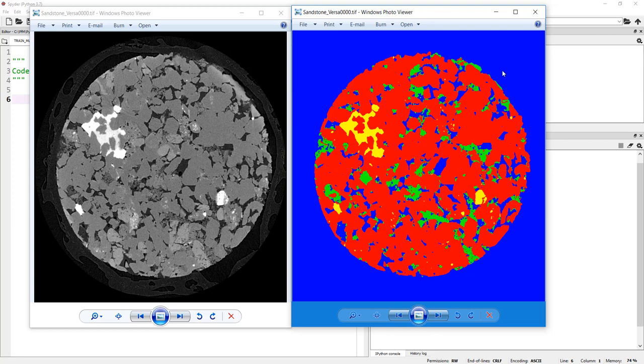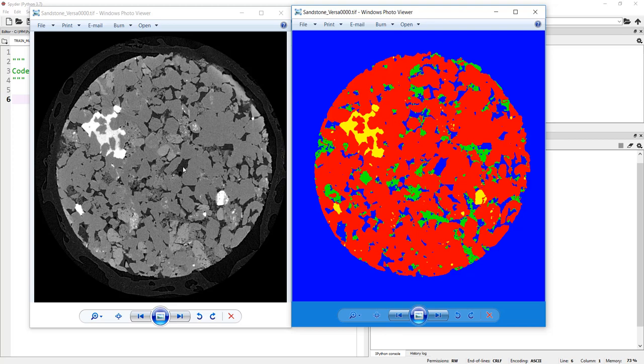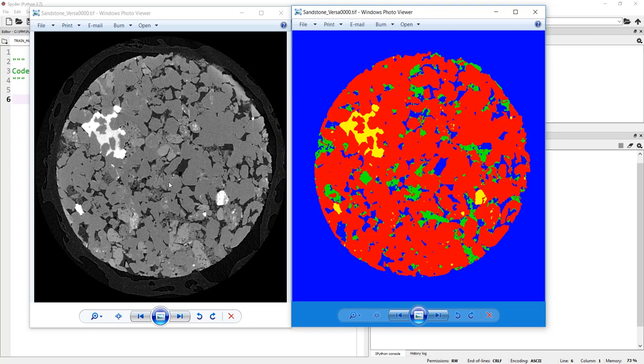In this example, I've labeled every pixel. Green regions correspond to clay, yellow to the bright phase, red is quartz, and pores are in blue. My volume has about 500 images. Of course, manual segmentation through every slice is not an easy task. Semi-automated methods using histogram or watershed are also not promising. I've tried that.